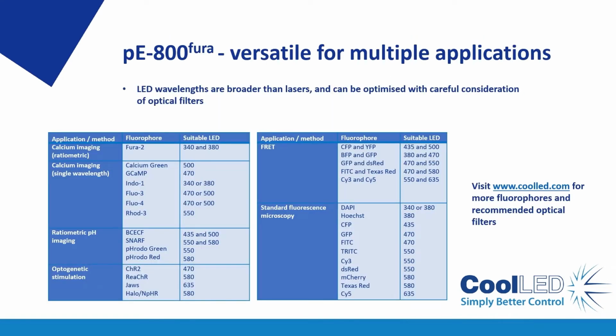LED wavelengths are broader than lasers and can be optimized with careful consideration of optical filters. In the tables here, you can see some popular fluorophores and their corresponding pE-800 fura LED.